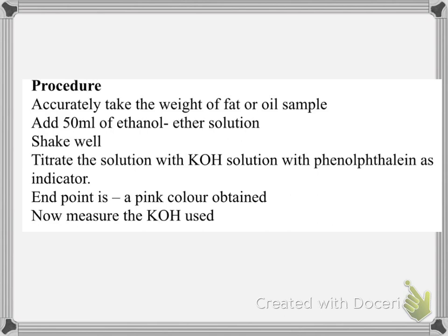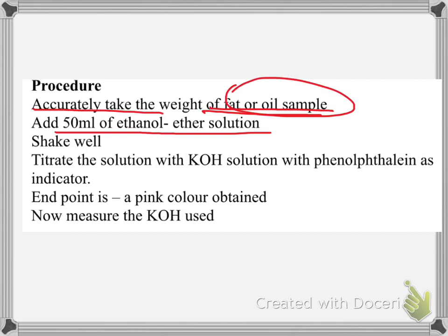The procedure is, first of all, we want to take an accurate weight of the sample, that is fat or oil sample, in a conical flask.